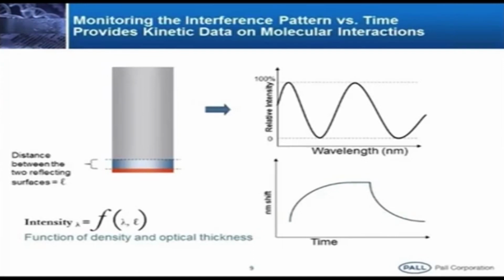So, when we say kinetics, most people do label-based platforms, kinetic studies like ITC, or ELISA-based methods, but all these other methods only give affinity constants. Suppose I plot a sigmoid like this, the midpoint, the IC50, we call as affinity. There are equations to calculate the affinity, but label-free platforms are the only instruments which give the on rate and the off rate values. None of the other instruments give the on rate and the off rate.